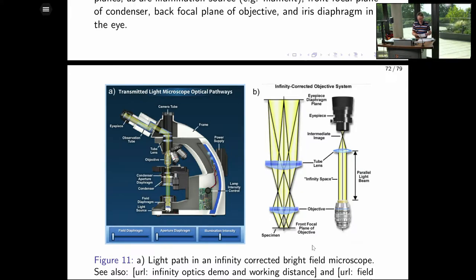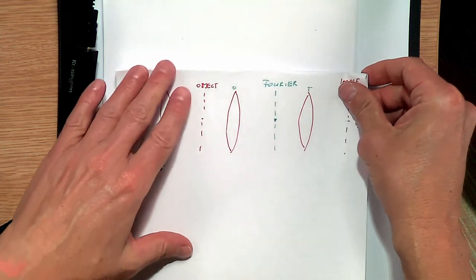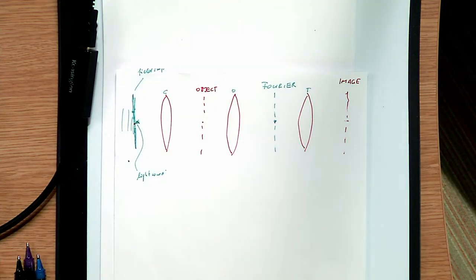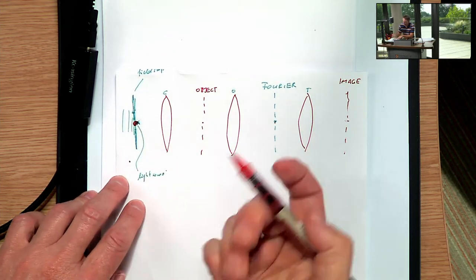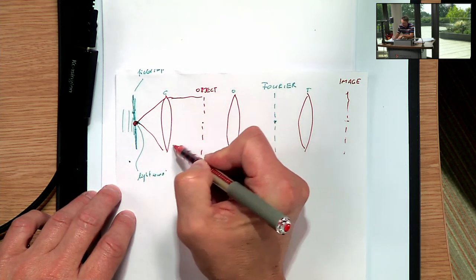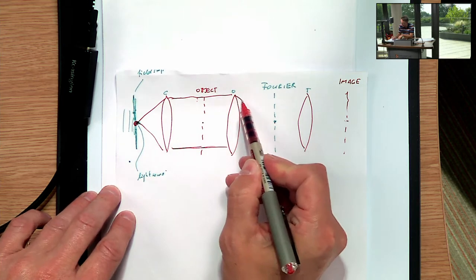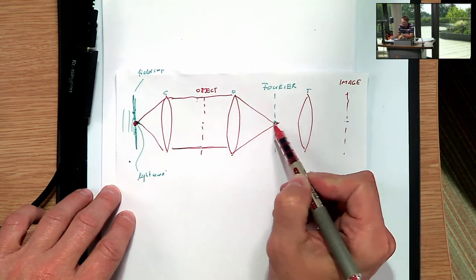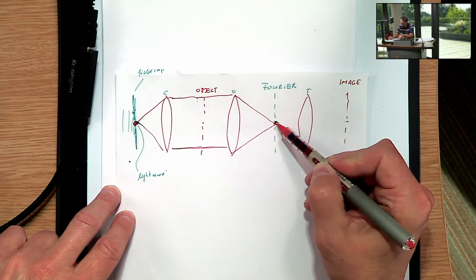So if I go back to the visualizer, I'll just show you this briefly here. So you have a light source. Let's say you have your light source illuminating the sample. For a bright field imaging system, you'd have a point source. You produce a plane wave that illuminates the object. And then you have a parallel light coming onto there. It gets focused onto a spot, as remember, in the Fourier plane. That's what bright field imaging does. The illumination light is focused to a spot.